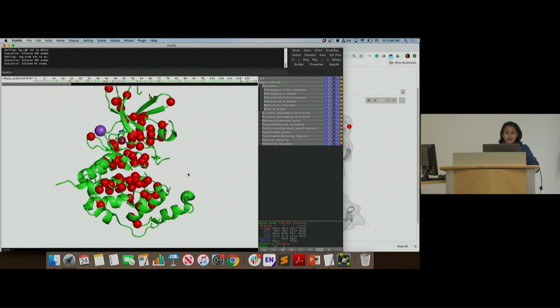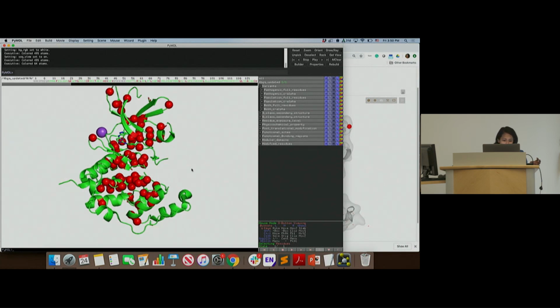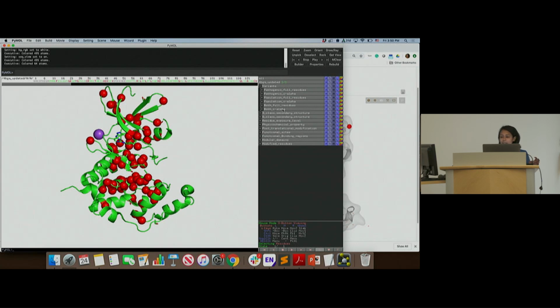So these are the sphere selection of your pathogenic mutations. The same thing that I showed you online, how to analyze the variants in the context of the feature. Let me highlight the spheres. You can really see these pathogenic variants, where they're actually in the core of this. Yeah, exactly. And if you highlight the population ones at the same time, you can see better.